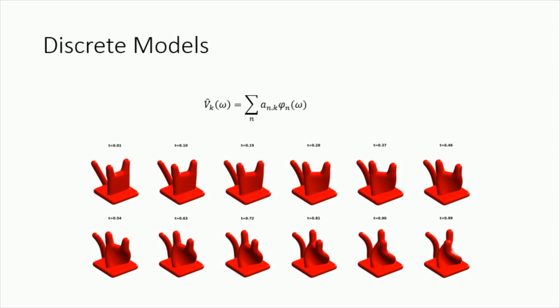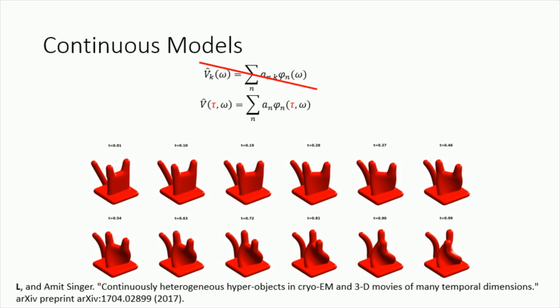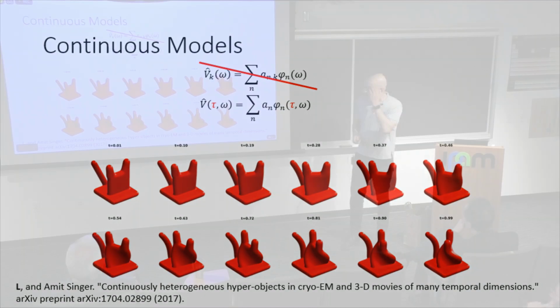Because there's some kind of smoothness in the transitions between these models. And we can capture this actually mathematically. For example, if we turn this into a four-dimensional function, and we take these basis functions that are smooth along these directions, this would be a better solution than these things that run around all over the place.